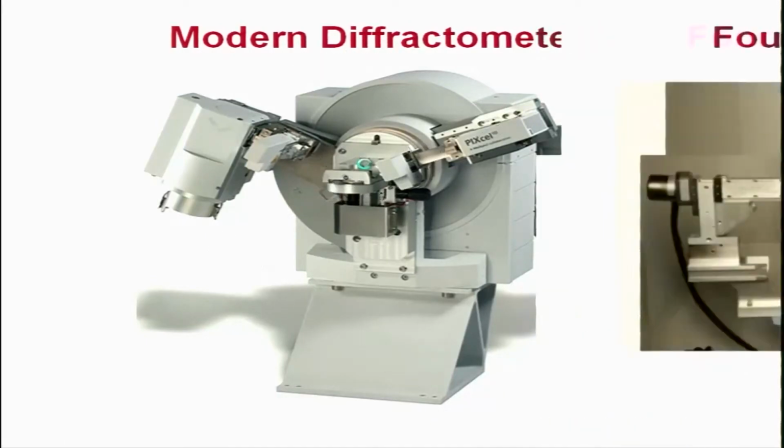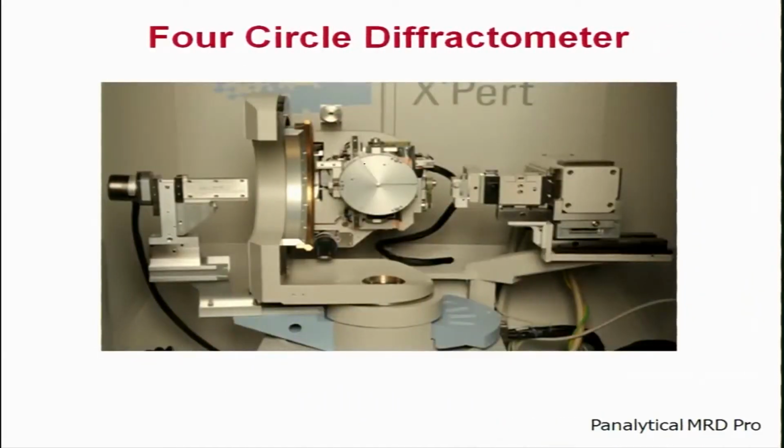In more advanced diffractometers you have a 4 circle diffractometer like this. So, you have the sample rotating within this plane, you have the cradle rotating, so this is phi, this is psi, and then your machine, 2 theta rotates, this is 2 theta, and then the sample itself can rotate within this plane.